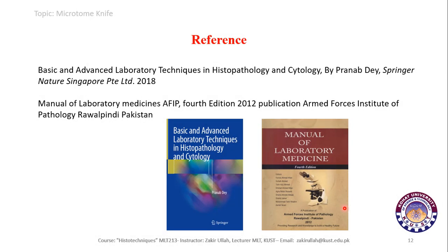That was all about the knives of the microtome. For further studies, you can look through these books and study them.